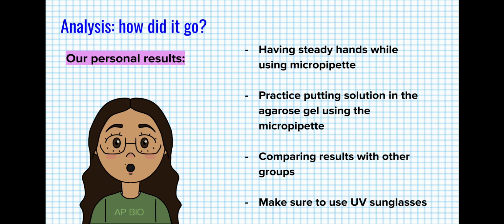Comparing results with other groups will help you understand the results better. Some lab groups might get clearer results than others, which can be beneficial when observing and analyzing data. Make sure to use UV sunglasses so you can avoid damaging your eyes.